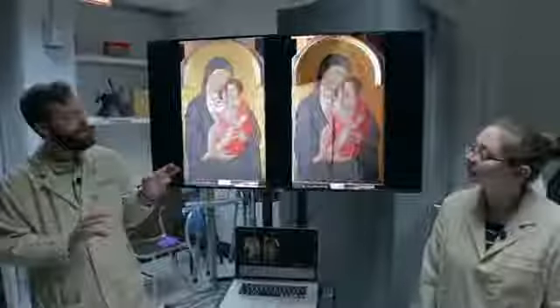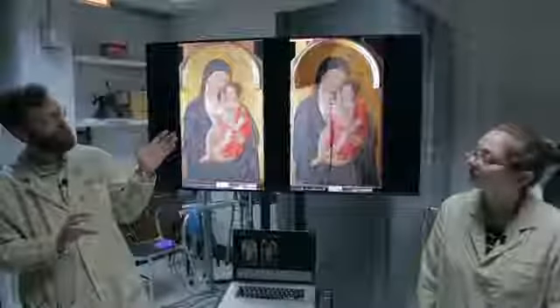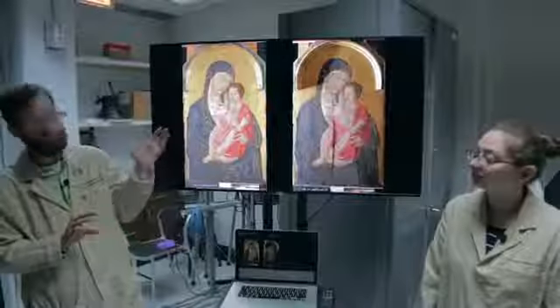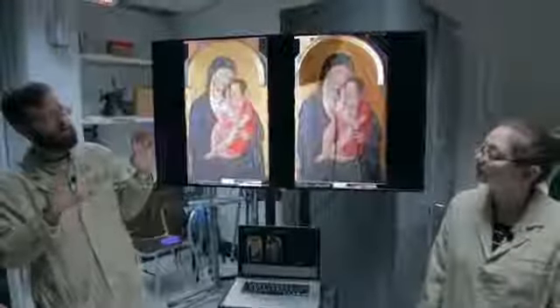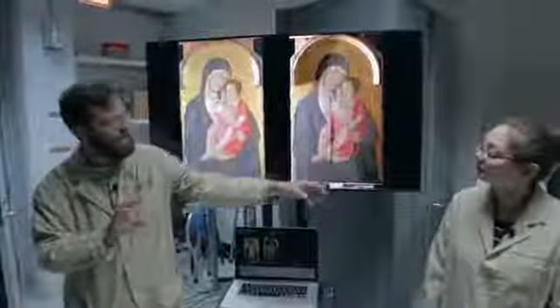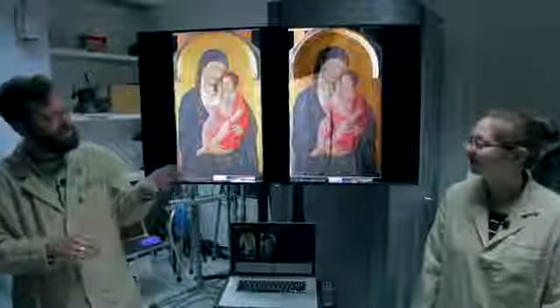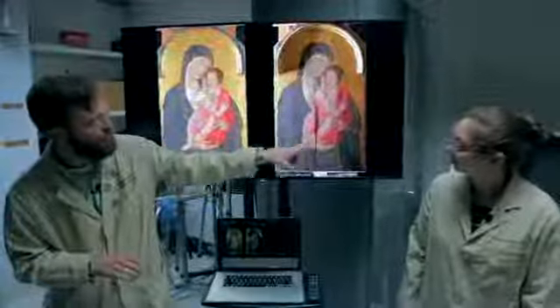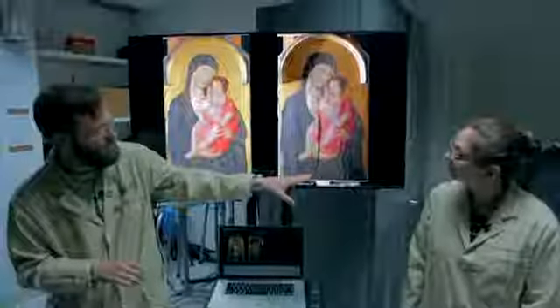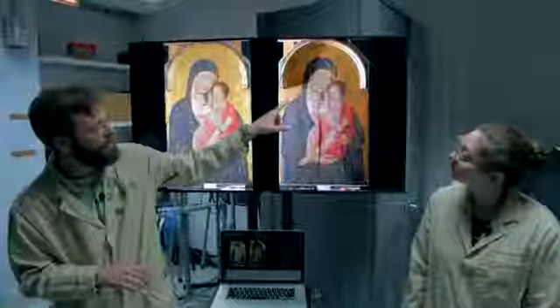What you're looking at here is a diffuse reflection image using visible light, what you saw when we were looking at it on the table. But if you move that light source to the far extreme, it will begin to cast shadows, and it gives you an idea of all the surface deformations that exist in this painting. You had mentioned earlier that it's a highly textured piece, and so you really begin to pick out some of that texture, examples of the cracks that are running through the surface, the craquelure that is in the paint.